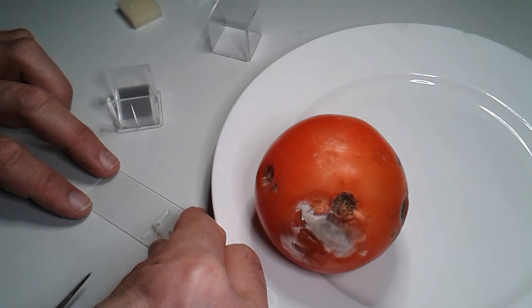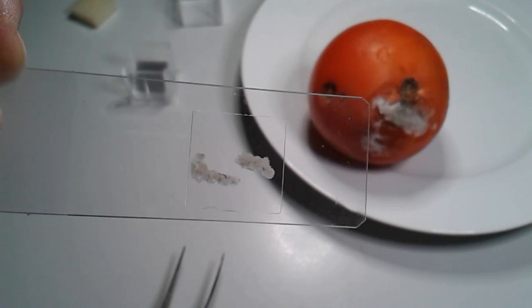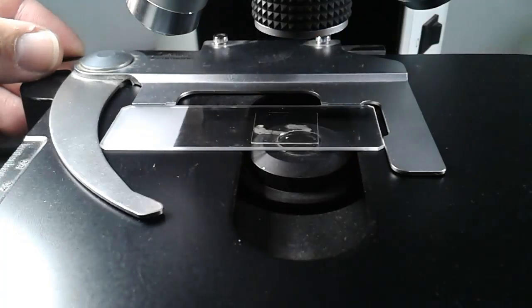There will always be a few air bubbles, but that is generally okay. That's the slide close-up. The mycelium is squashed and then I place it on the stage of the microscope.